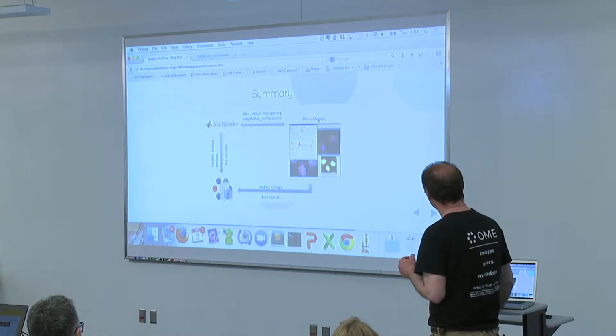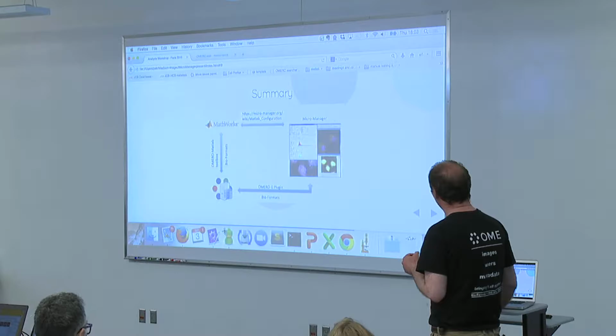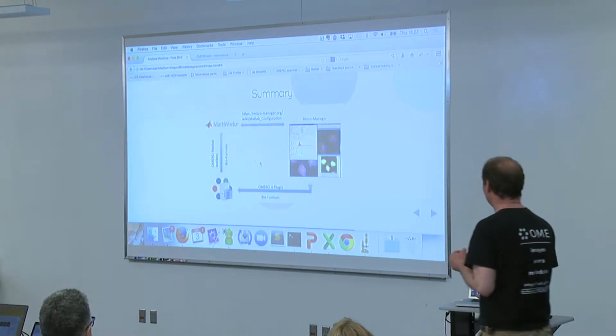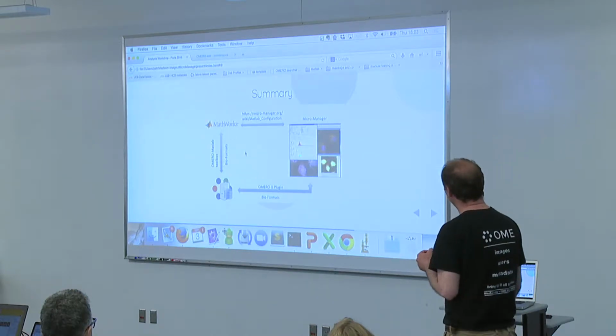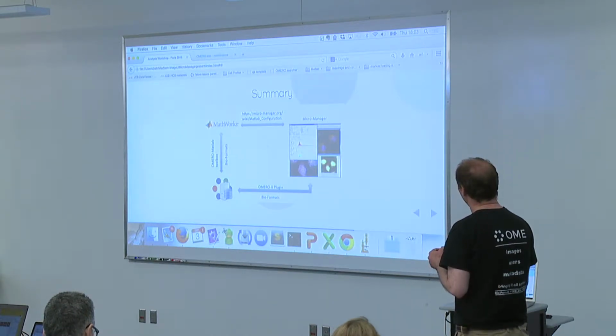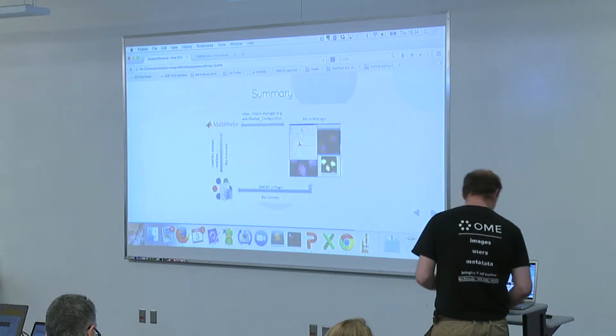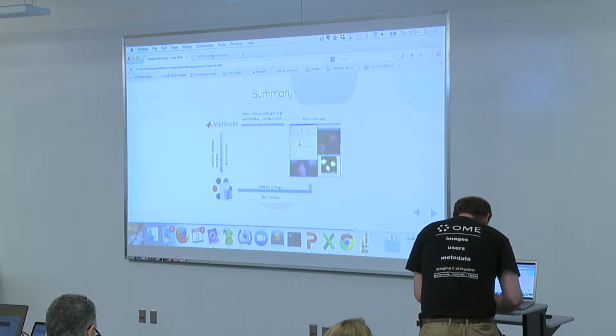So I just mentioned the Micromanager and the OMERO IJ plugin, and the MATLAB part, which already exists in MATLAB. This is because Balaji loves MATLAB, but as I said, we will rather aim to make it possible for developers to write this part in Java. Okay. So, and now let me show you the OMERO figure.